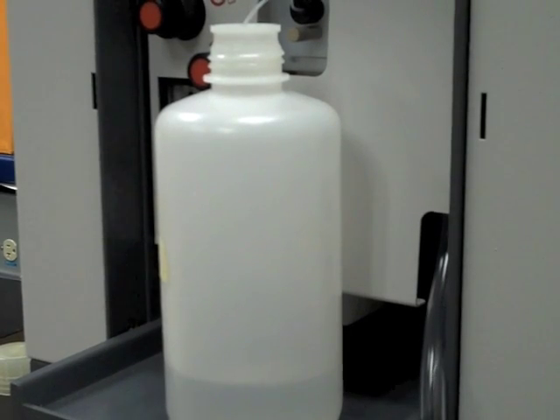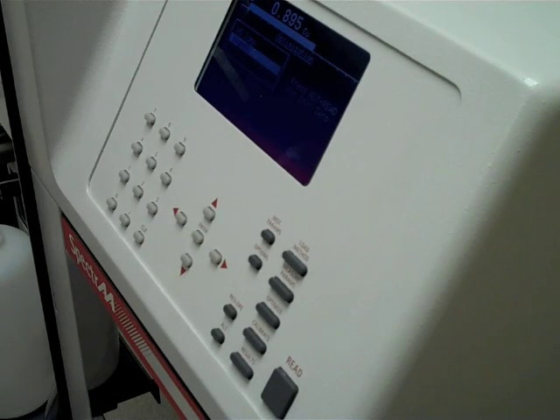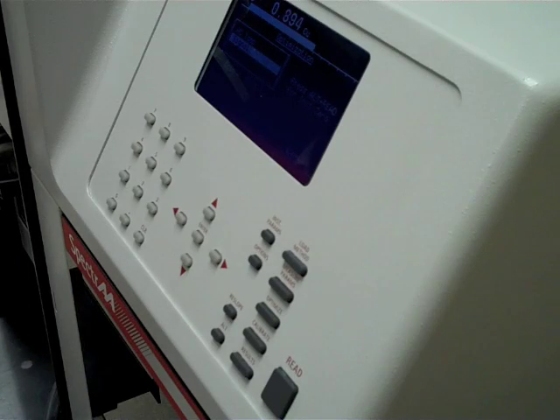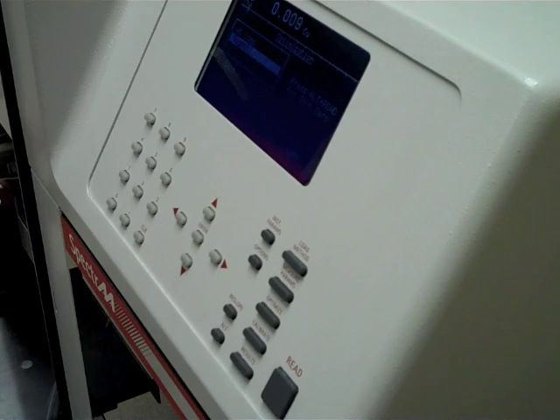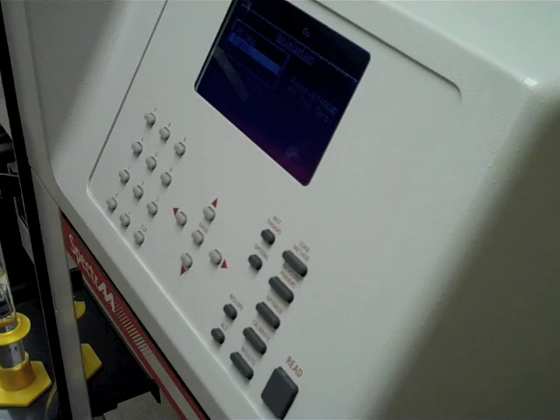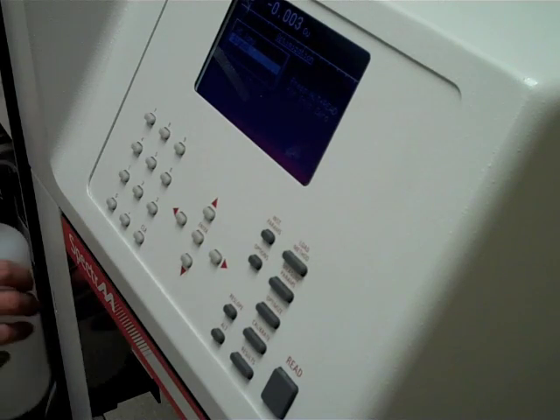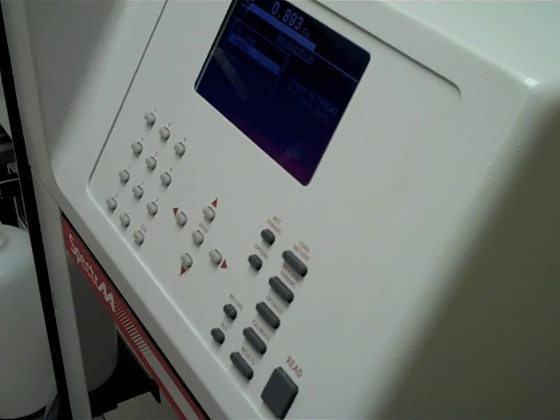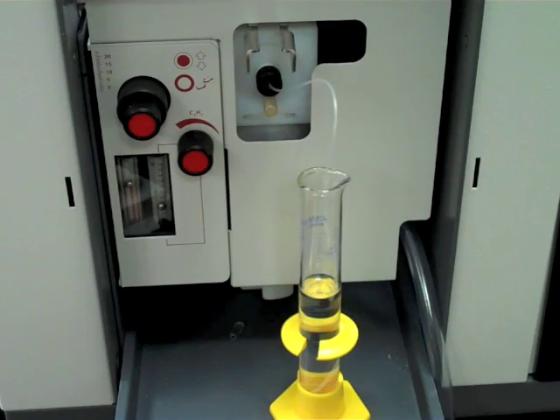Rinse with deionized water or the blank solution in between the standard or sample solutions and see that the reading returns to zero. If it does not, the instrument has drifted — press the Alt and Read buttons simultaneously and repeat the measurement on the previous solution. Keep the new value and discard the previous reading. The signal is inherently noisy, so record five readings at evenly spaced time intervals and use the average for your calibration point or sample absorbance.